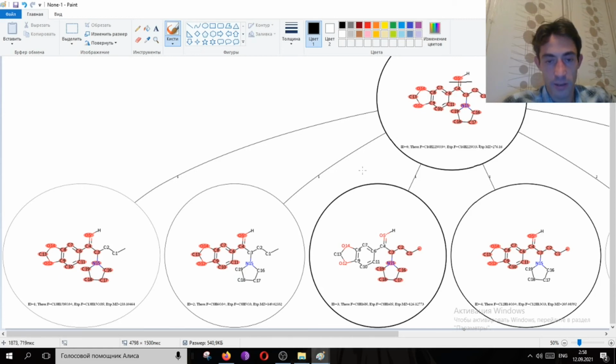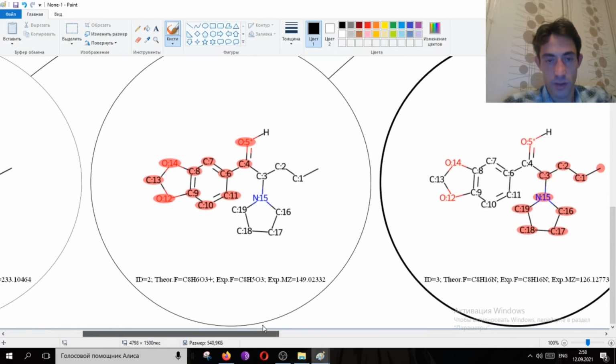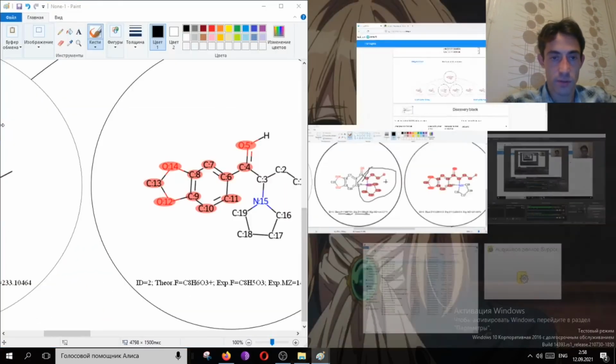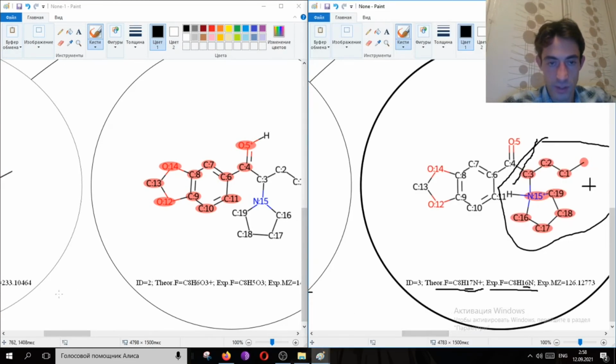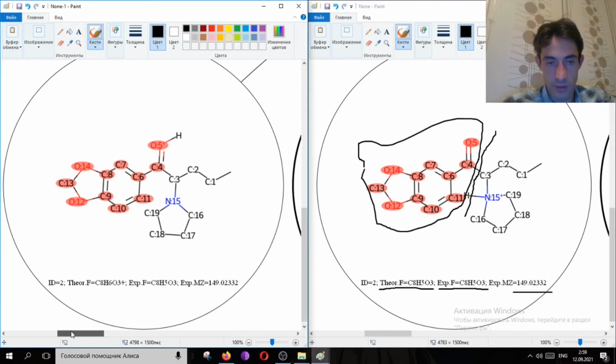So let's have a look at these two fragments.